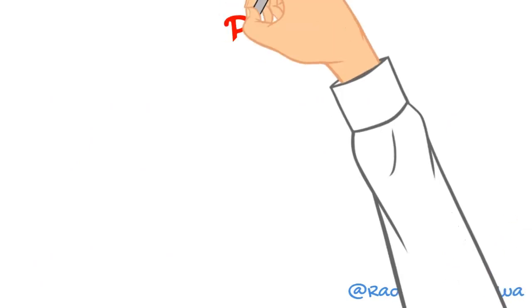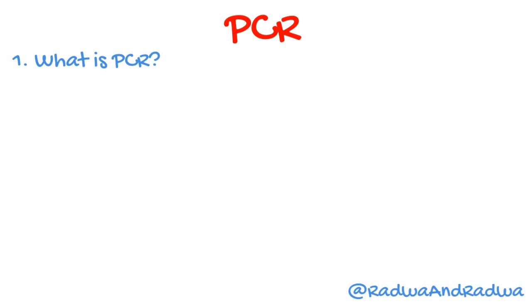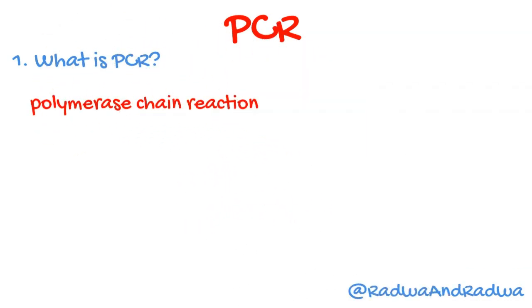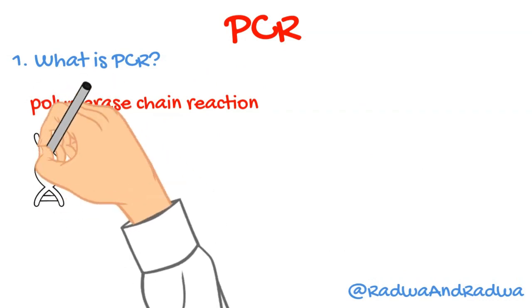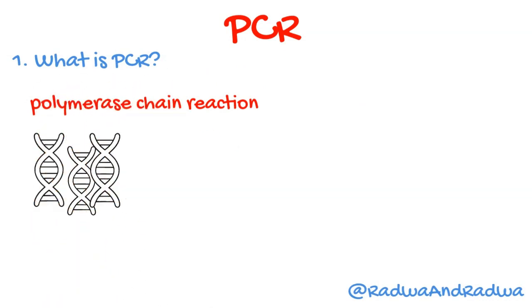In our episode today, we will be talking about PCR. So many people started to talk about PCR more when COVID hit. And today we would like to ask Radwa to explain to us what the PCR technique is. Sure. So PCR is short for polymerase chain reaction. And it's a technique that we use in the lab in order to synthesize thousands, if not millions of copies of a specific DNA that we're interested in detecting.